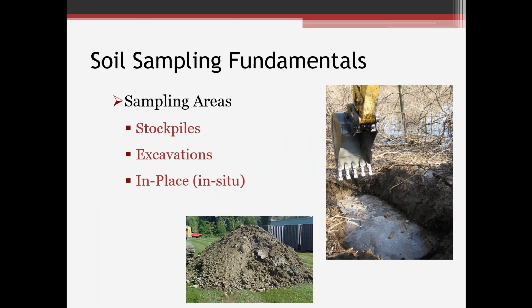So some other things: sampling areas. What are we looking at sampling? Are we dealing with stockpiles? Are we dealing with in-place soil, in situ soil? Or are we doing this as part of an excavation area where we want to sample the excavation to see if we're into clean material, if we're doing a remediation type project? That's going to help dictate how we go about the sampling. Obviously, if we're dealing with a stockpile, and we're sampling the entirety of the stockpile, we've got a good idea. We can see it. It's right there in front of us. We can break up the samples and get a good representative composite sample pretty easily.